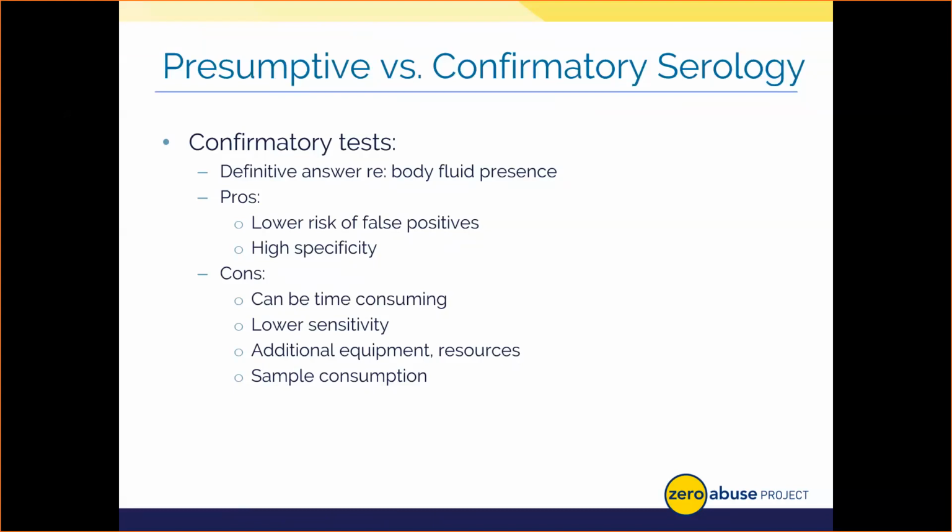Confirming a body fluid is great for you as the MDT member or prosecutor because it can give you that informative detail as to what body fluid was present, helping give a better understanding of a given crime or context to a piece of evidence, while at the same time allowing the analyst to feel confident on processing that item for DNA from that stain. For example, knowing and being able to say that a stain is semen versus only being able to say that it's possibly semen from a presumptive test can make a world of difference in substantiating your case of, as an example, child sexual abuse.